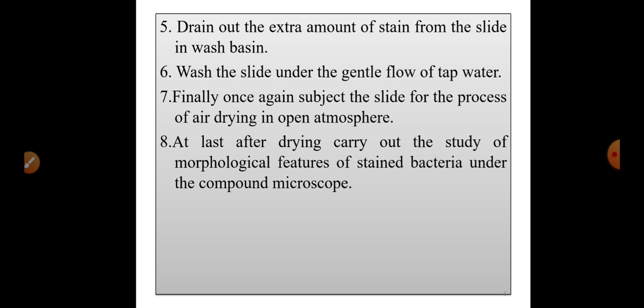Fifth step: drain out the extra amount of stain from the slide into a wash basin. Then wash the slide under a gentle flow of tap water. It is important to keep the water flow very gentle — if you wash under a fast flow of water, the stain may wash out.